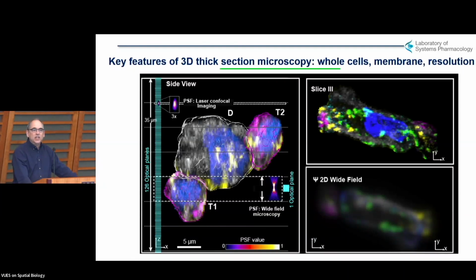And it's accomplished in these type of microscopes by optical sectioning. And the blue on the left shows you how many optical sections we took, in this case around 130. So we move the specimen just a tiny little bit, it's all done automatically, of course, and then we collect another image one after another, and then you do this 3-dimensional reconstruction.